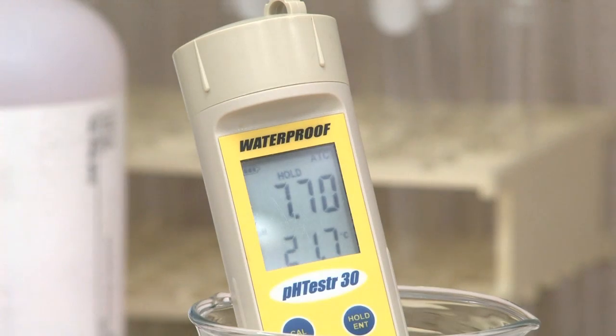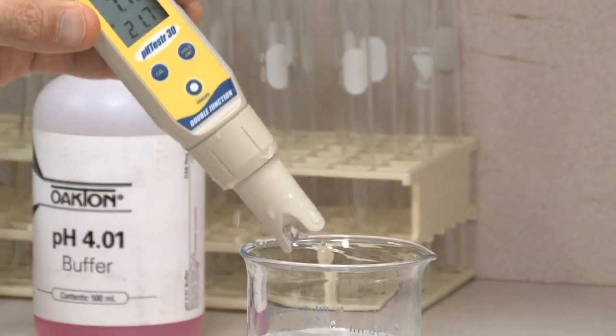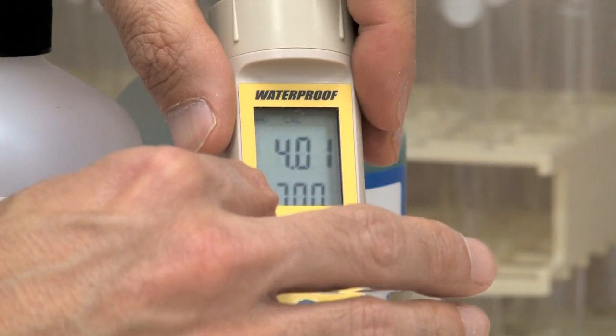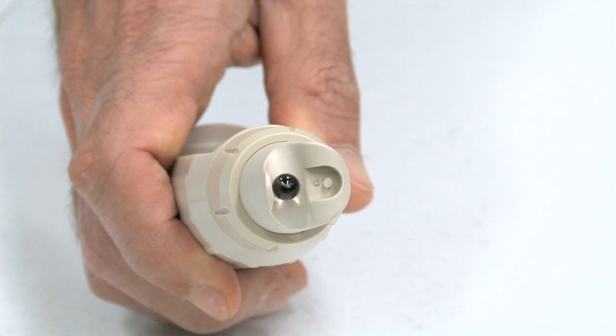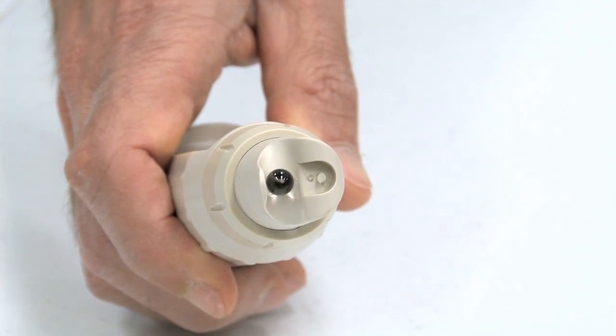Delivering greater accuracy and longer life, their advanced features include a large liquid crystal display with oversized digits for at-a-glance views, up to three-point calibration with auto-buffer recognition, and a chemical-resistant PVDF double-junction sensor which minimizes contamination and extends sensor life.